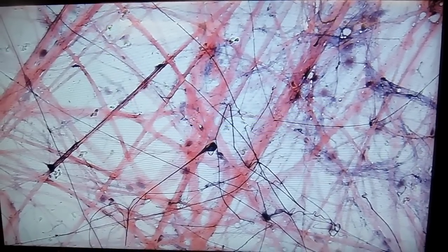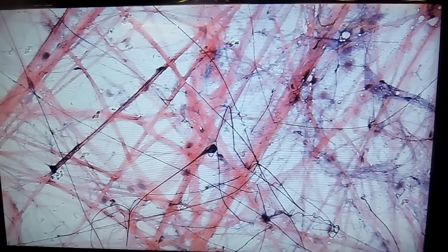And some of those will be nuclei of fibroblasts, which are the connective tissue cells that maintain the matrix.